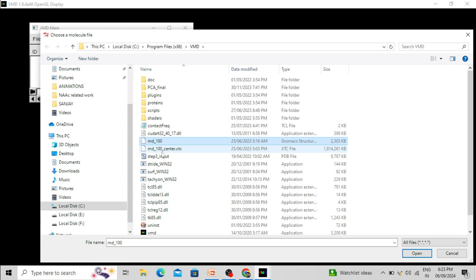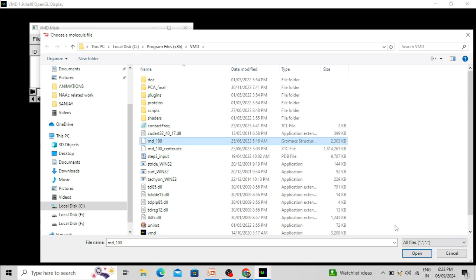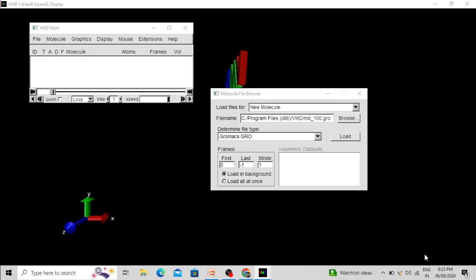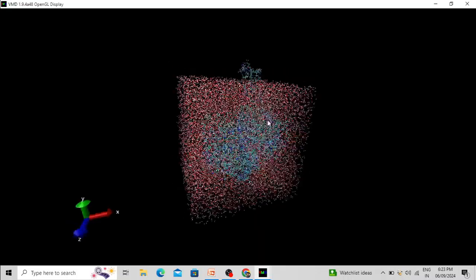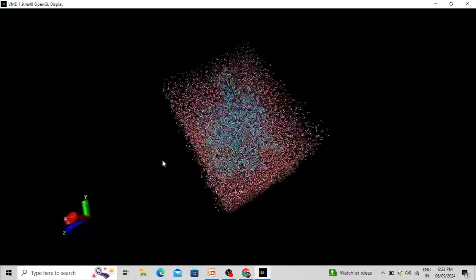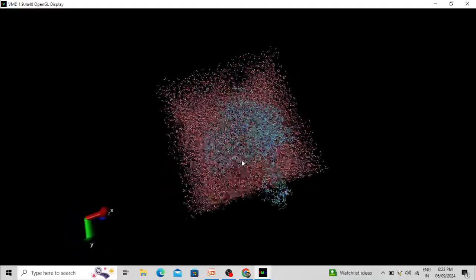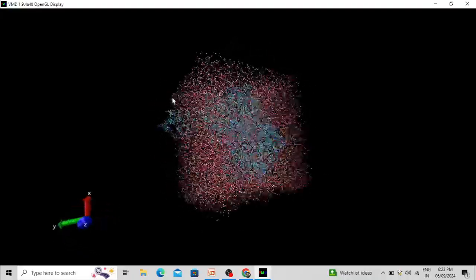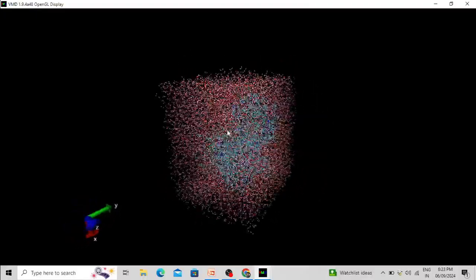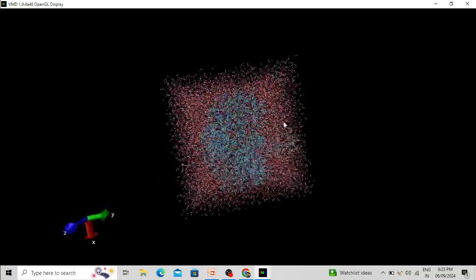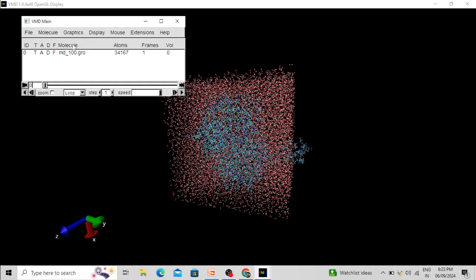I am loading md_100 into VMD software. You can also see the trajectory file named md_100_center.xtc. First open the structure file and load it. This is the complex along with water molecules, ion, protein molecule, and ligand molecule. Now we have to load the trajectory — the data about the movement of this complex.